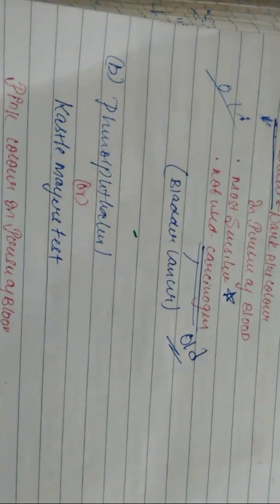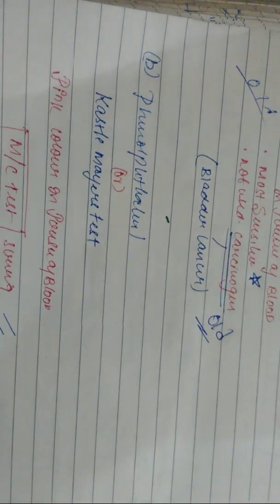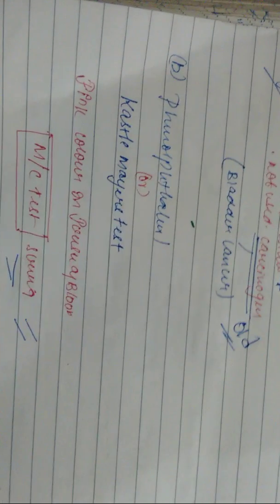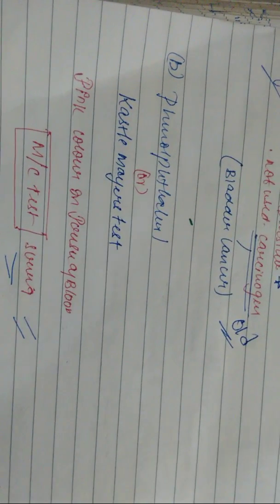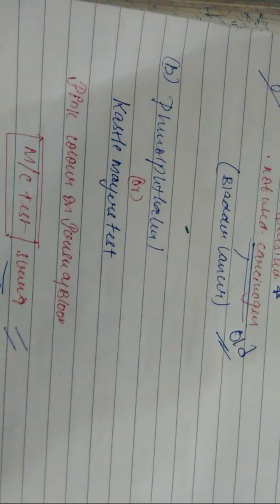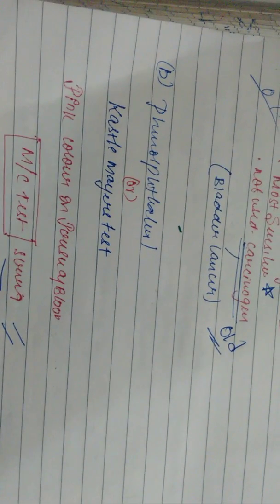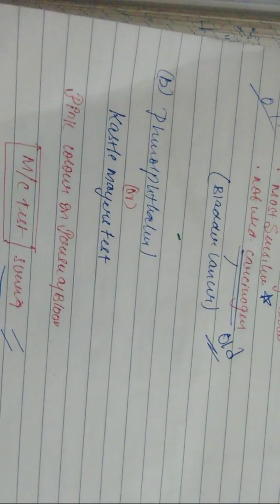So what does this phenolphthalein test? This test gives a pink color in presence of blood and is the most common test for screening, right? So now let us understand how, in the presence of blood, this phenolphthalein changes color. Let us understand the concepts here.